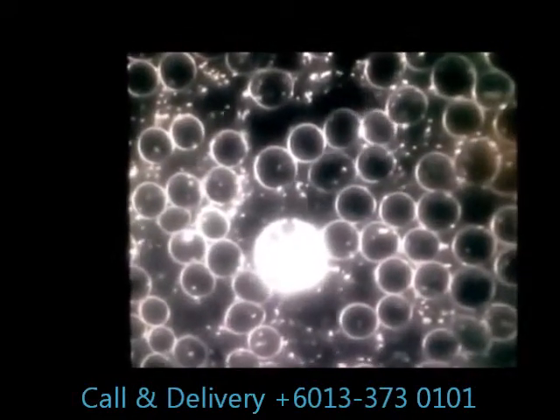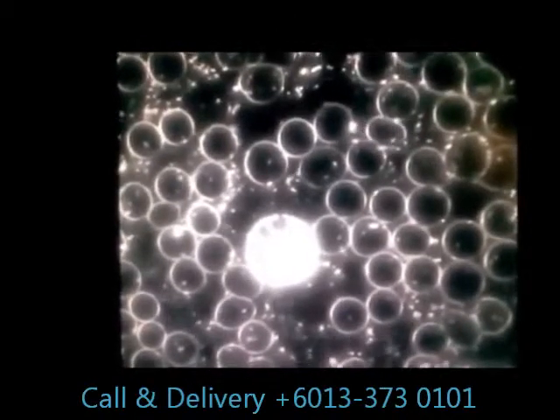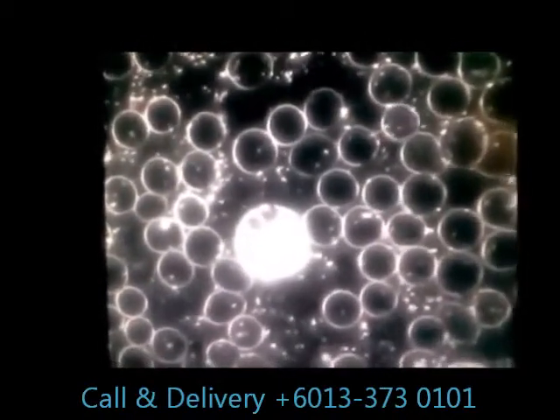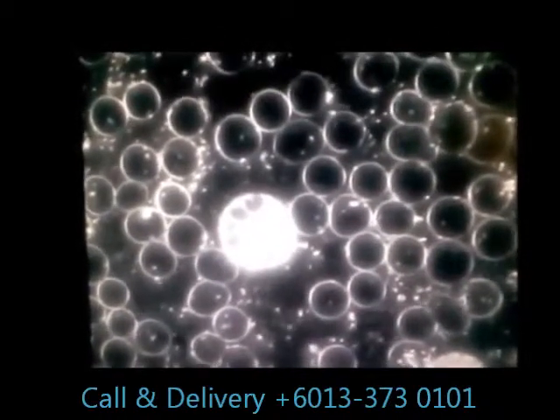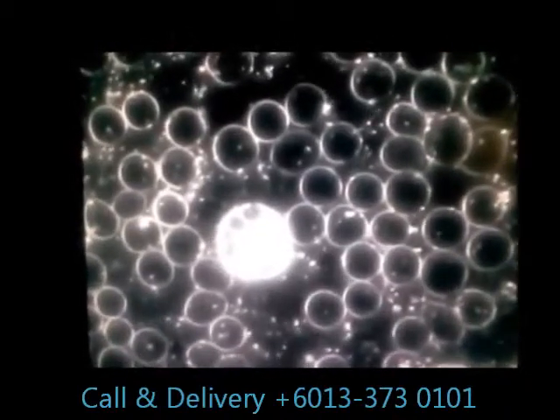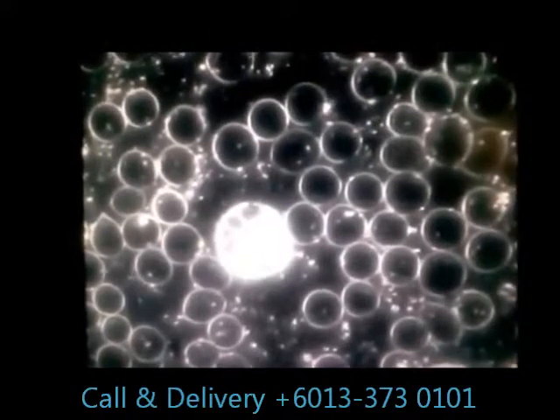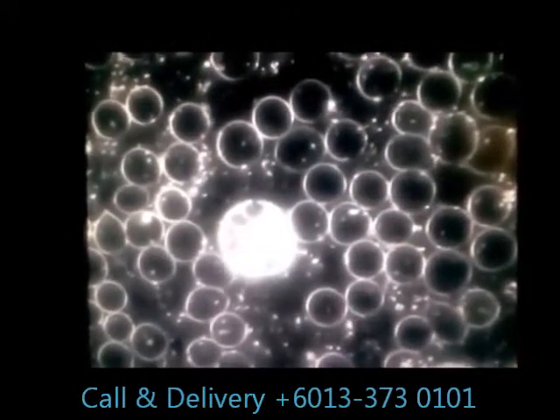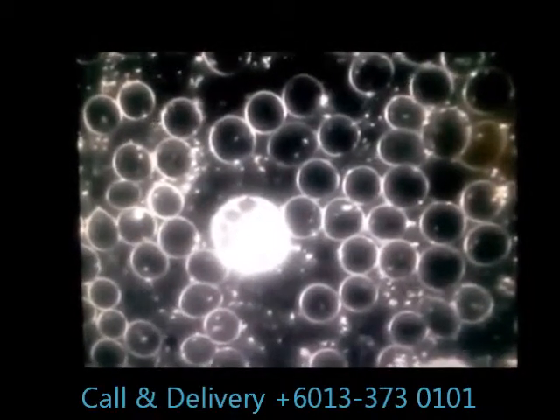Here is the 1 hour after the soul product video. As you can see, the red blood cells are perfectly round. They're kind of touching each other, and that's okay. They've only got so much space to run to. And in the center you see a white blood cell with 4 lobes inside. So this is a good white blood cell as well. This is the 4th and final stick.